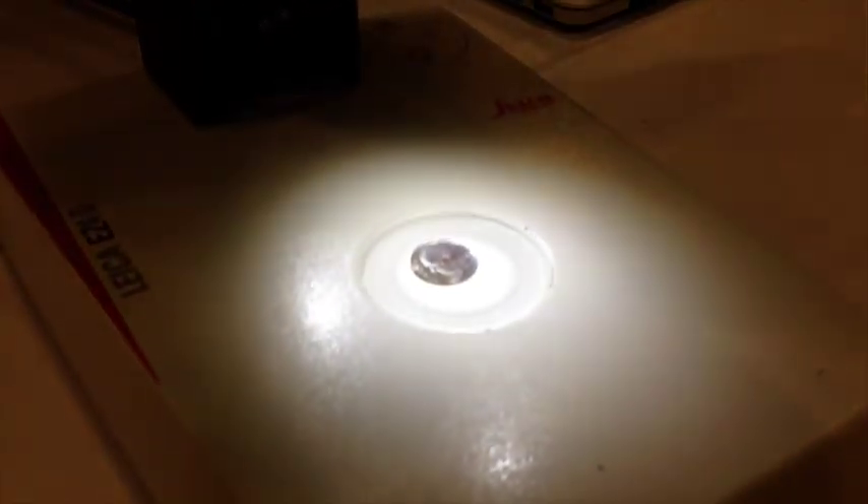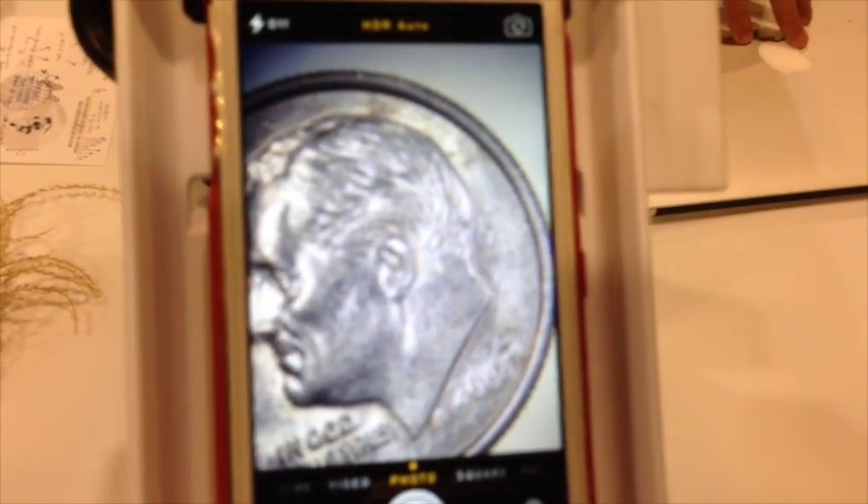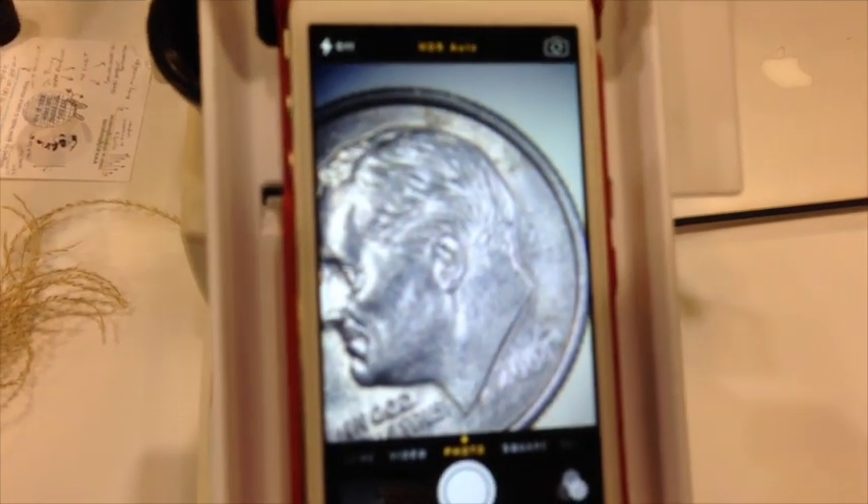There's our specimen down here, which is a dime. And here's what it looks like on the phone. The phone isn't doing anything special — whatever you're looking at through your microscope is what you're going to see on your cell phone. If you have a compound microscope you can look at cells, a stereo microscope you can look at bugs, a fluorescence microscope you can do high-end research-level microscopy. Depending on your phone, you can get a 5, 8, or even 12 megapixel image.